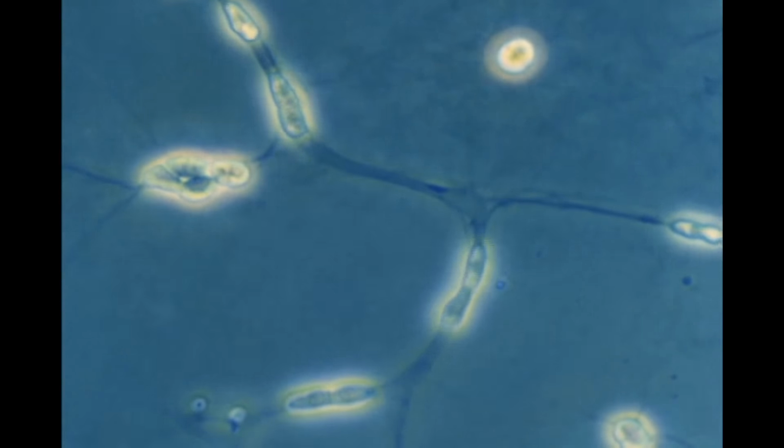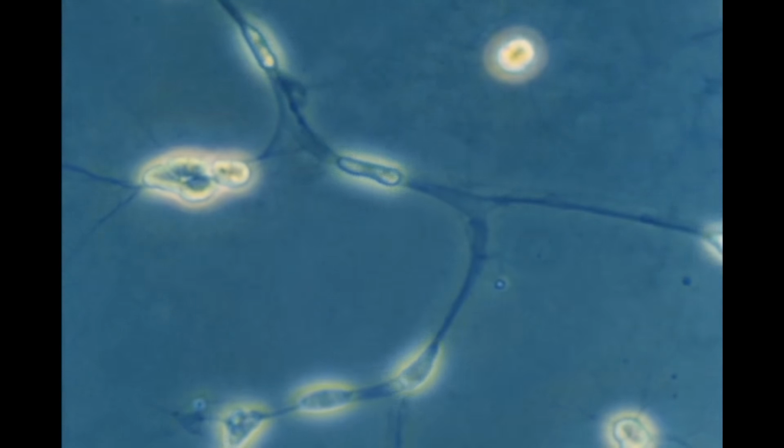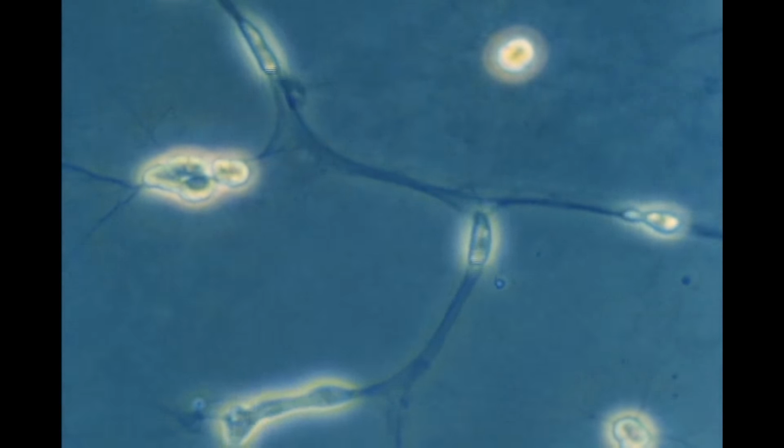The cells of Labyrinthula move only within strands of the extracellular network or matrix. Often the cells are constricted by the confining matrix. The individual cells are about 10 microns long.